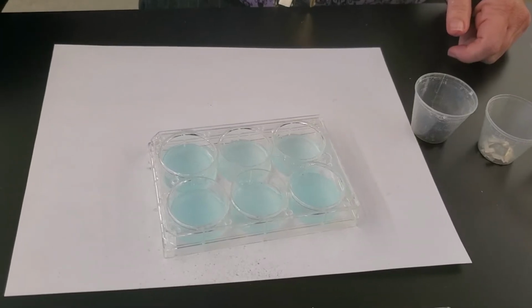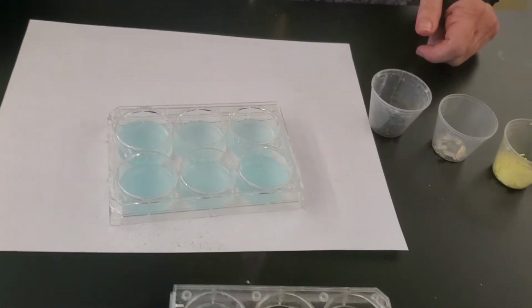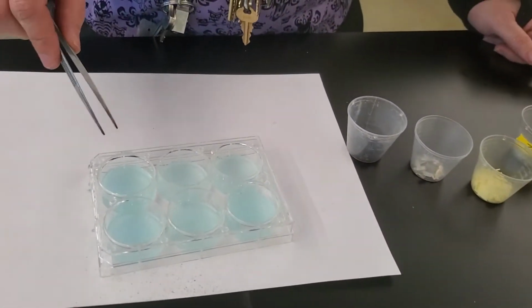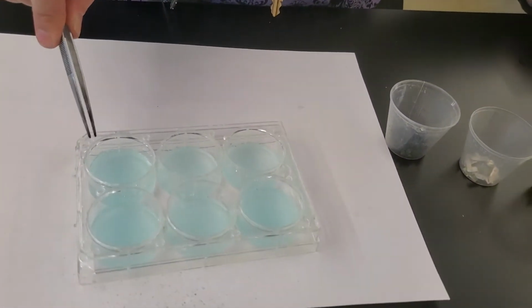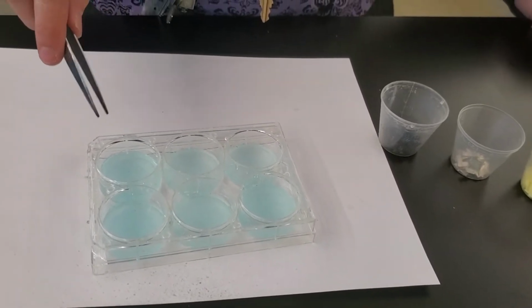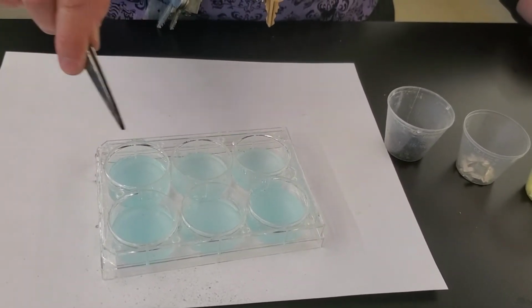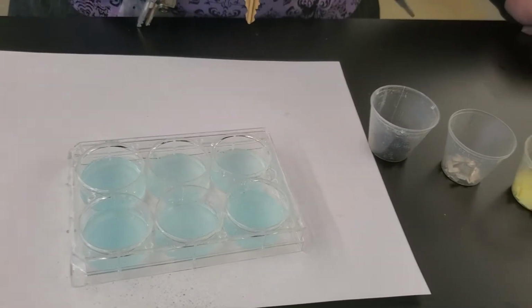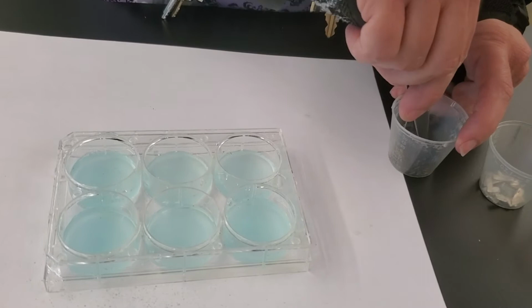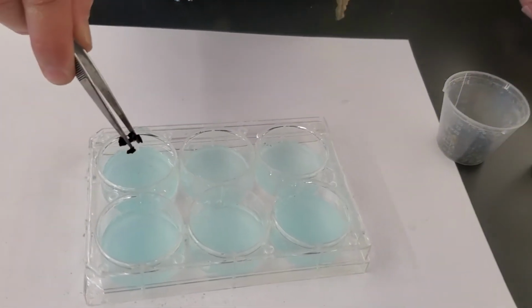So now I'm going to do a demonstration for you with 6 different elements, and I'm going to react them, or see if they react, with copper chloride. So this is a compound of copper chloride, and I've diluted it. It comes as a solid, and I diluted it with water to make a liquid solution. So each of these elements are going to go in the copper chloride, and you're going to see what happens to each. So first is the carbon.